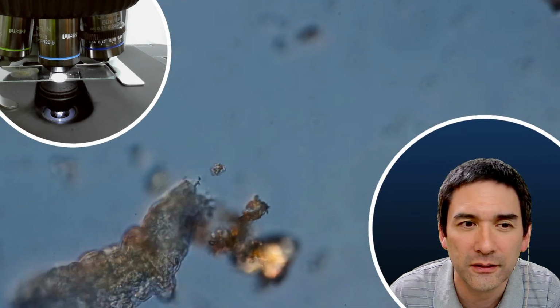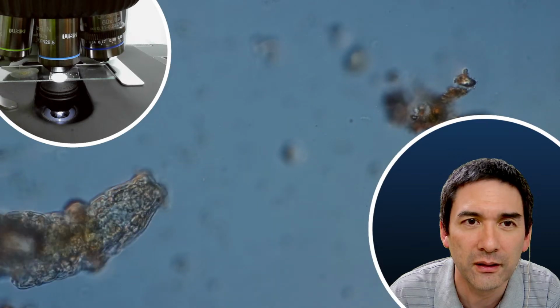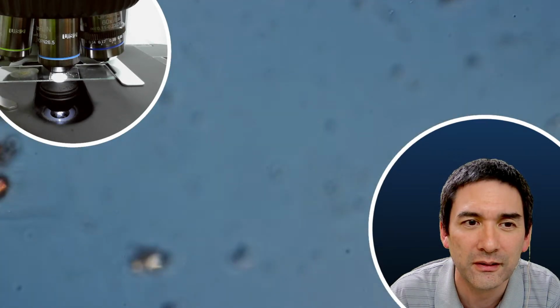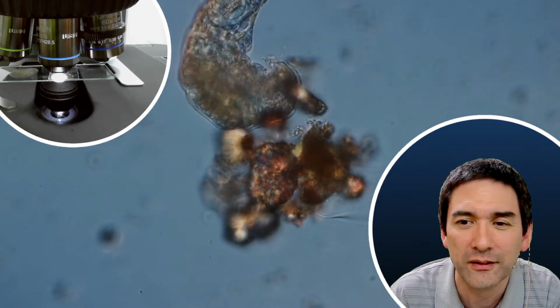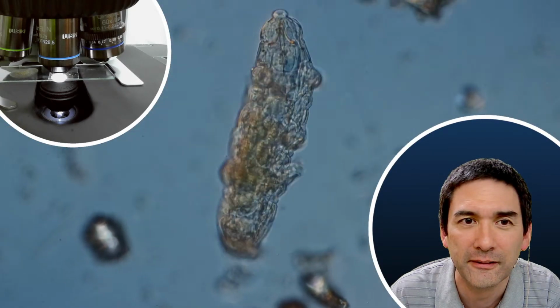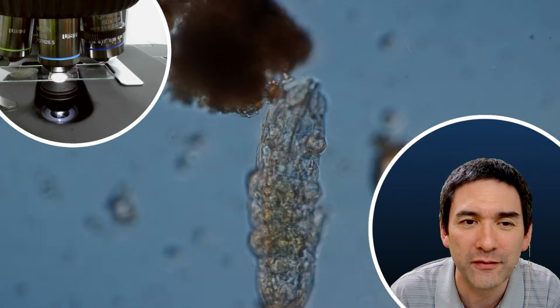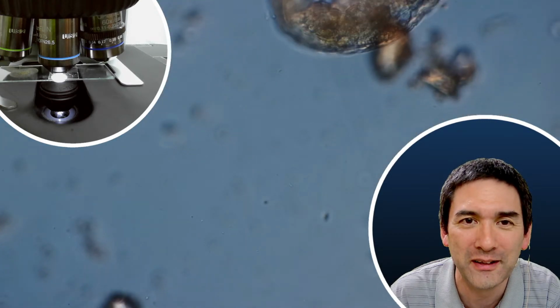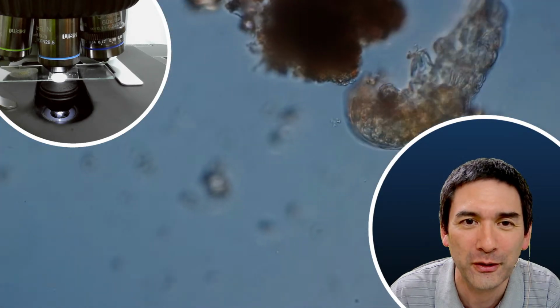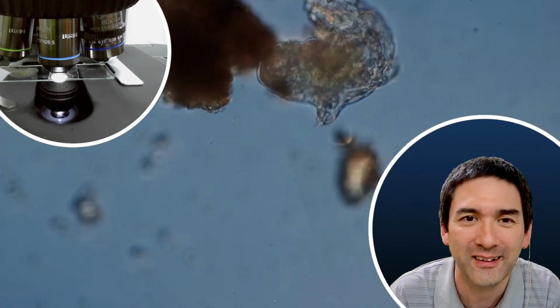And I actually was able to, oh, look at this, a protozoan. Again, almost the same size as the tardigrade. I was really stressed out at the beginning of the live stream, because this one tardigrade that I wanted to show you was actually gone, but we were very lucky that we were able to find one.